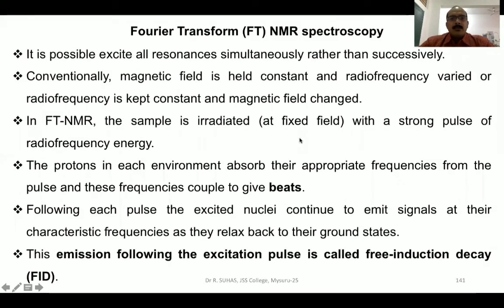Now we will take up the next topic, that is Fourier transform nuclear magnetic resonance spectroscopy. In short, we call it FT-NMR. We have seen earlier about the instrumentation of NMR, and in what way this FT-NMR is different. That is what you have to understand first.